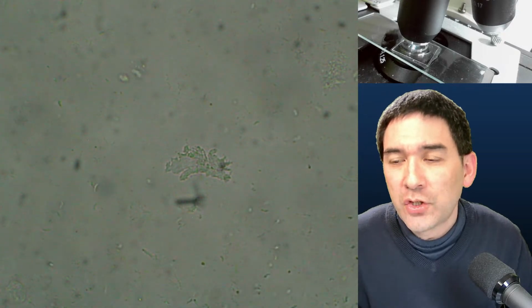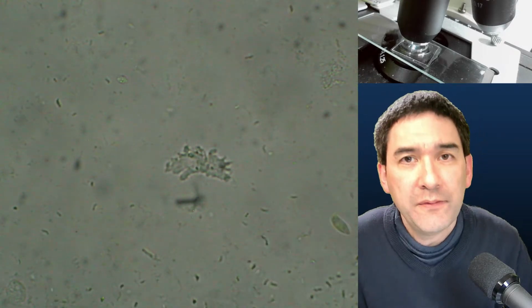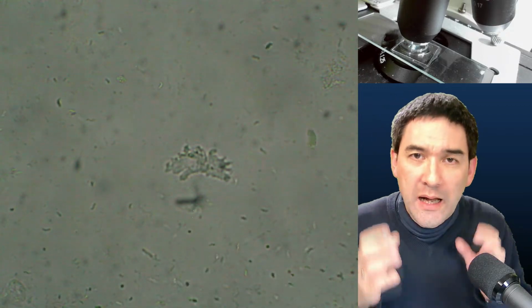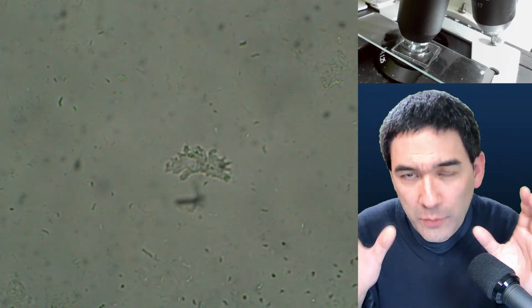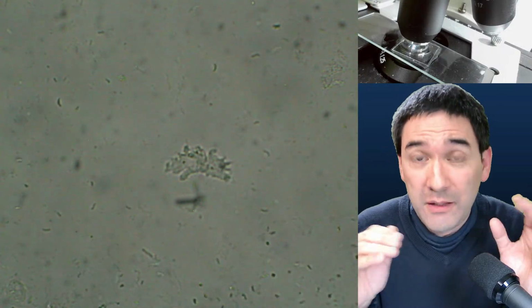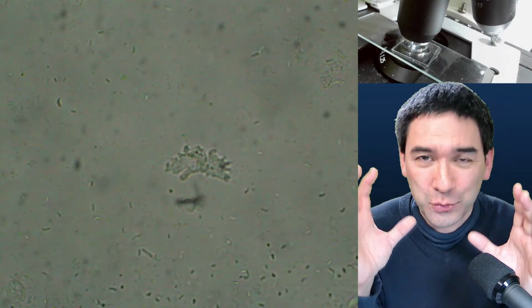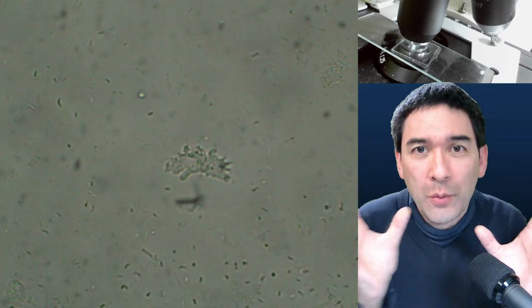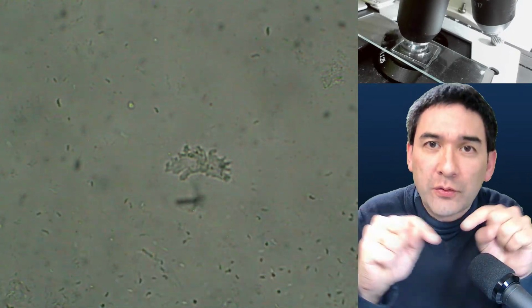Yeah. There are special dark field condensers to buy which are not cheap. What is the advantage over patch stop? Yes, the dark field condensers have a significant advantage. Maybe it's just a special condenser which also only has a flat disk inside, but the real dark field condensers have concave mirrors on the inside which actually redirect the light.